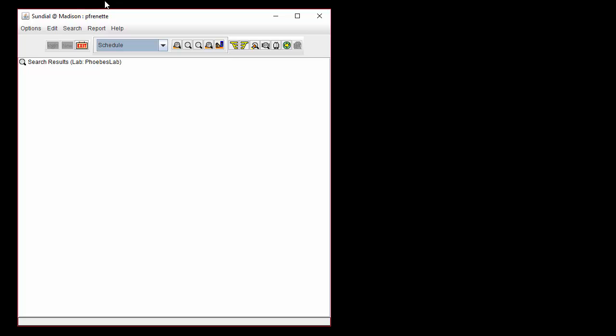The Spectrometer Lab Resource is a list of the different spectrometers that are used at your lab. This lab resource is maintained by the lab master or by a lab member who has been given permissions through the Can Do Lab Resource. To learn more about the Can Do Lab Resource, see our videos and help pages.